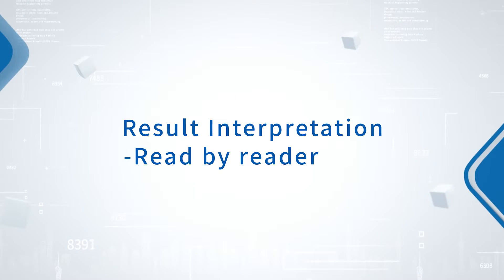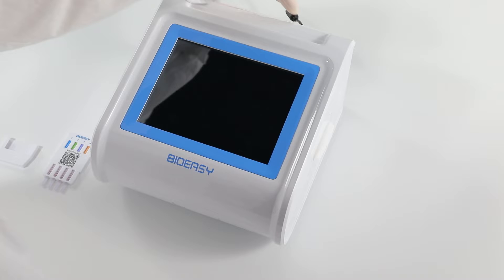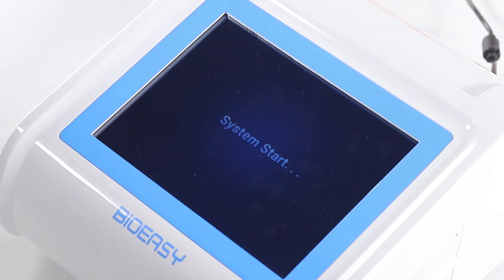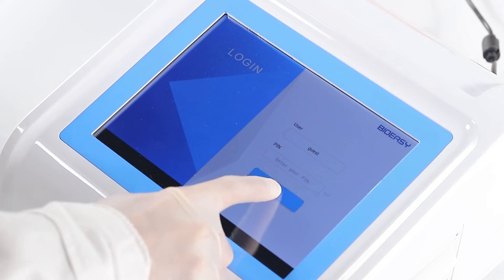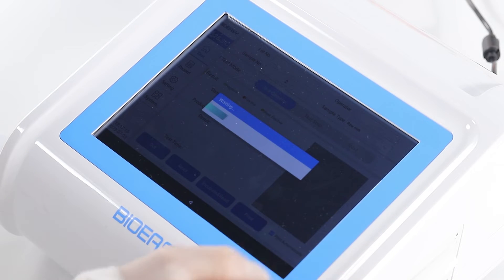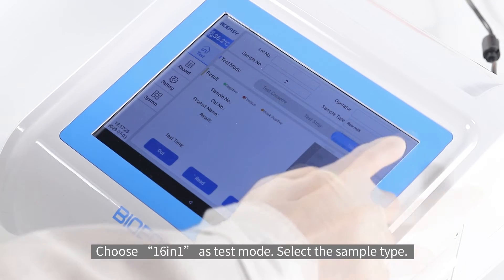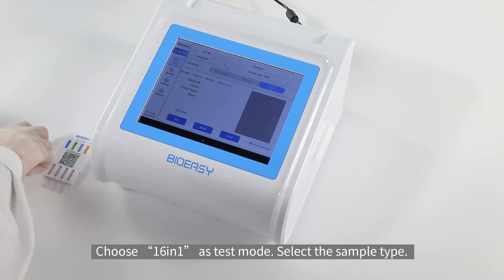Result Interpretation. Read by Reader. Turn on the reader, log in the account. Choose 16-in-1 as test mode, select the sample type.